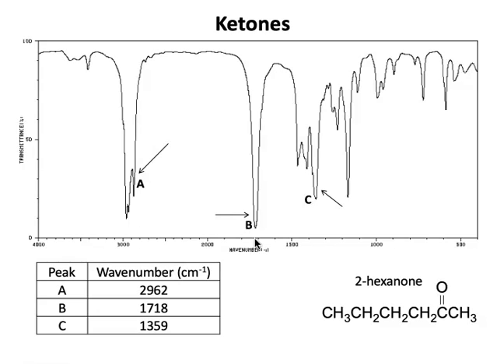Here's a real typical ketone. Once again, we're going to concentrate on that peak around 1700, and everything else, who cares? Yay, we got some CH stretches. Well, no duh, we're in an organic class. Of course, we have CH stretches. You can also start to see that this fingerprint region looks very different relative to something else, but we're not going to spend too much time talking about what all these other silly little peaks are due to.